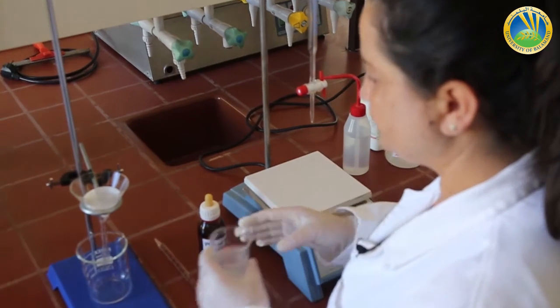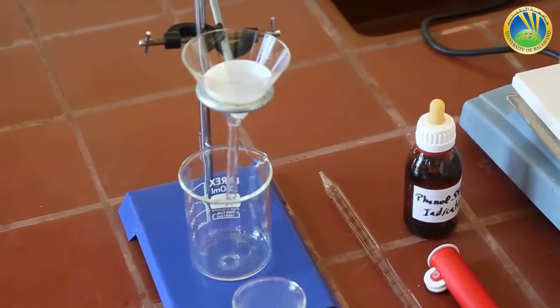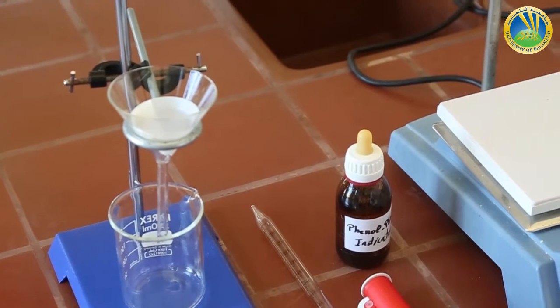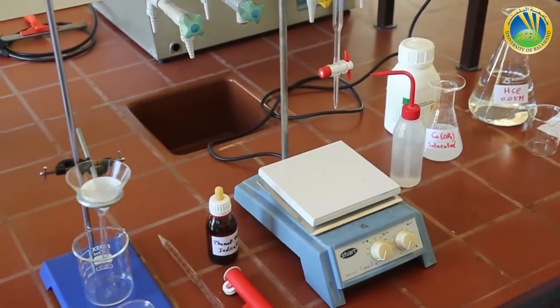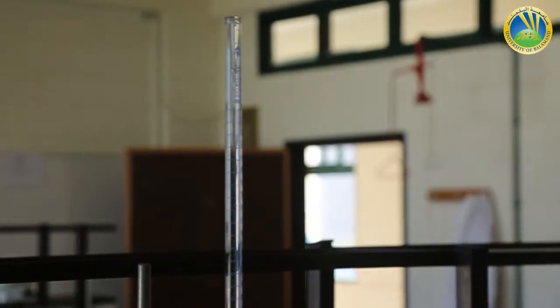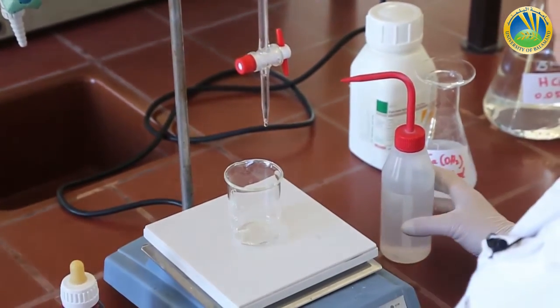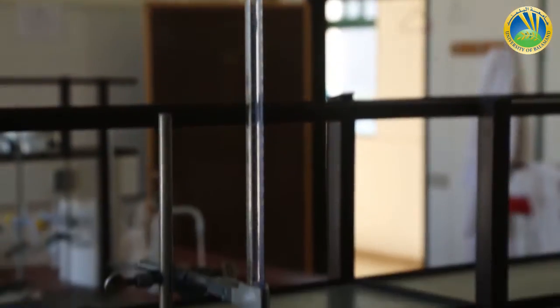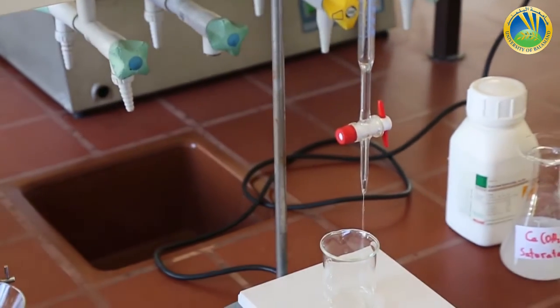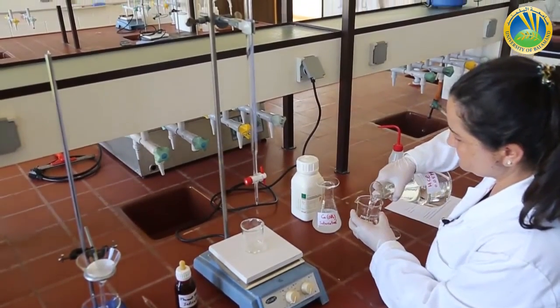While waiting, I go to my burette to rinse it — first with distilled water, then with my titrant. I rinse it first with distilled water.